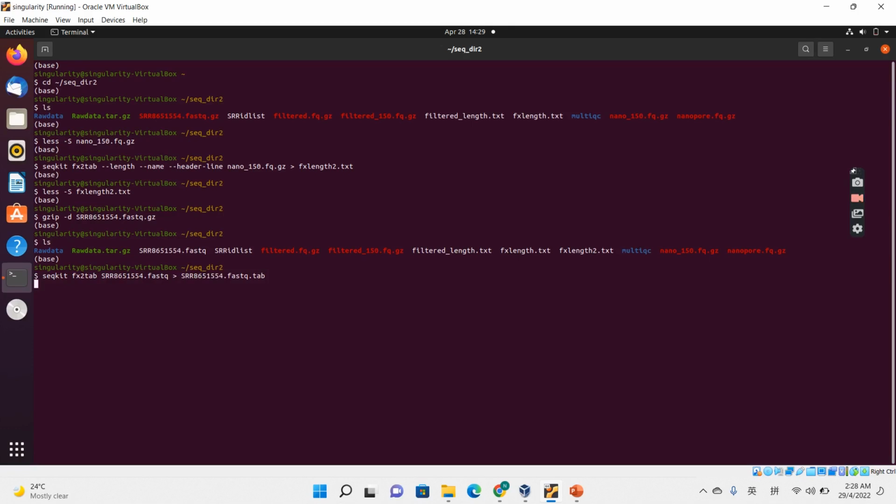Just wait for a while. So look at the output, just type less -S SRR865.tab.